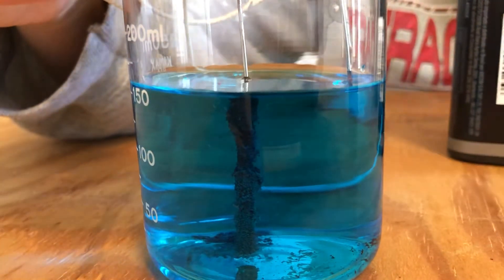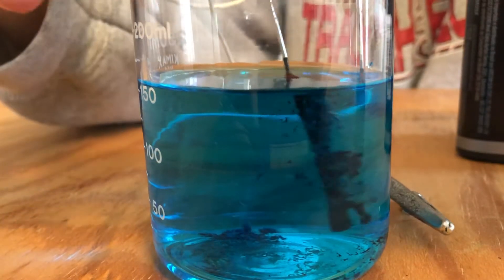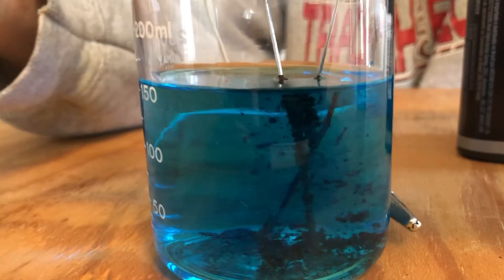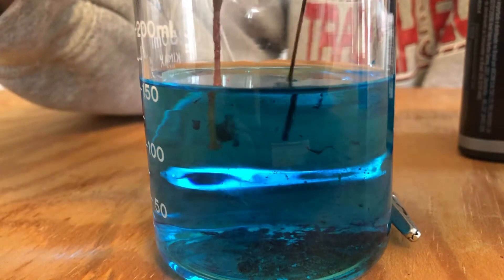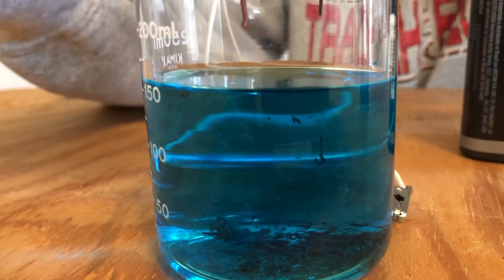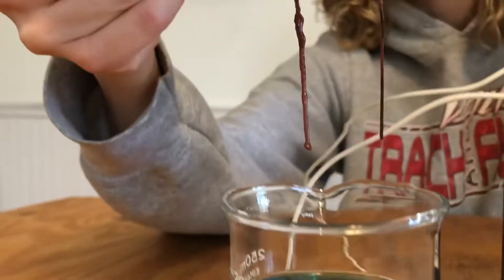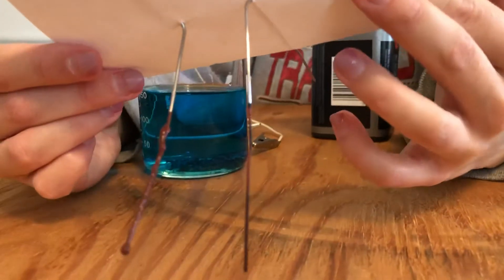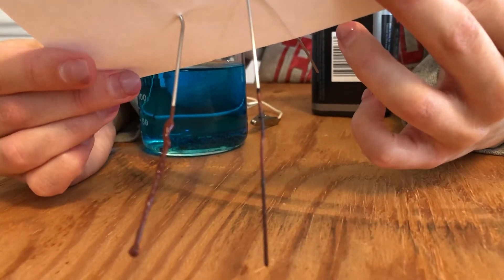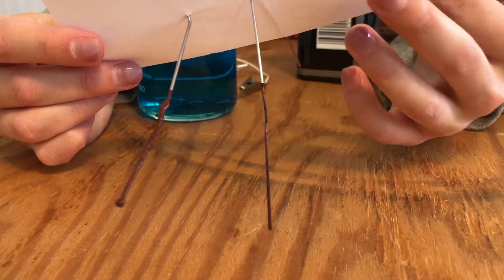I'm going to detach my alligator clips first, very carefully here, then remove my electrodes from the solution. Notice how much precipitate fell off of this electrode right here. If we look at it more closely, you'll notice the difference in the texture between the electrode on the right and the electrode on the left.